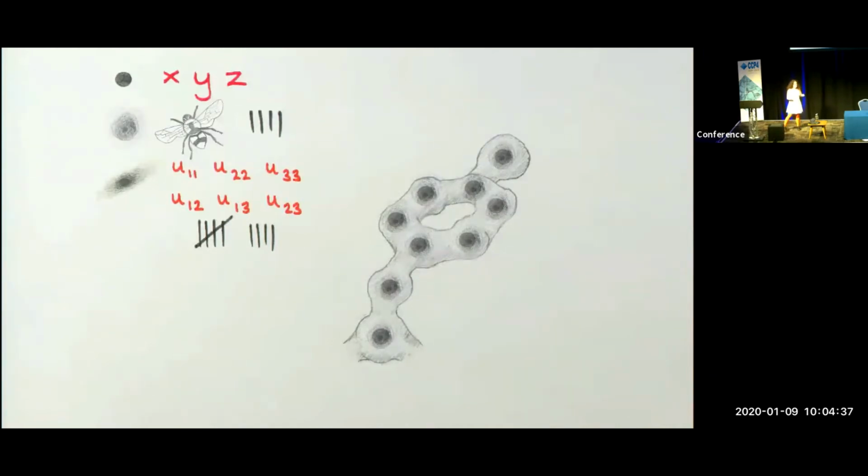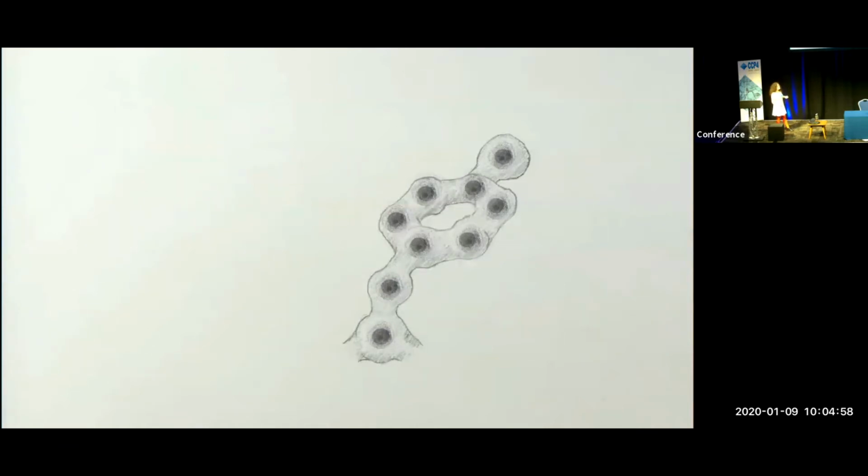And in both of these cases, this is a very large number of parameters per atom and usually almost entirely exceeds the number of unique observations during a data collection. And if you didn't add any additional restrictions, then this would be a very unstable refinement and lead to overfitting. So for atomistic refinement, the target function is actually split into 2 components.